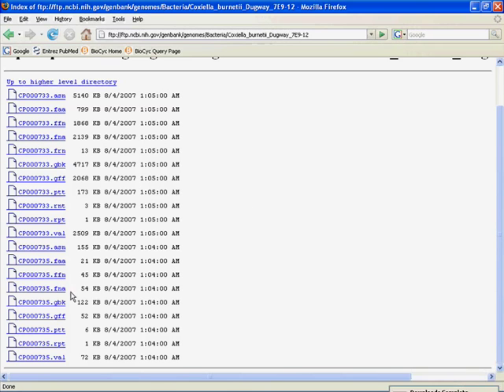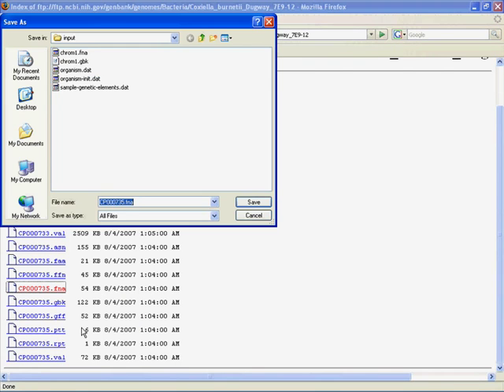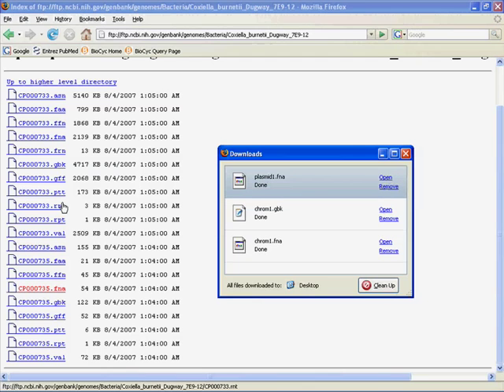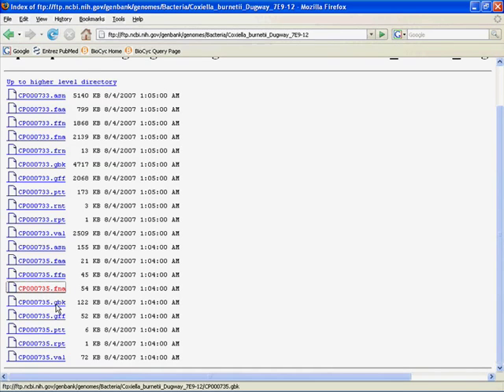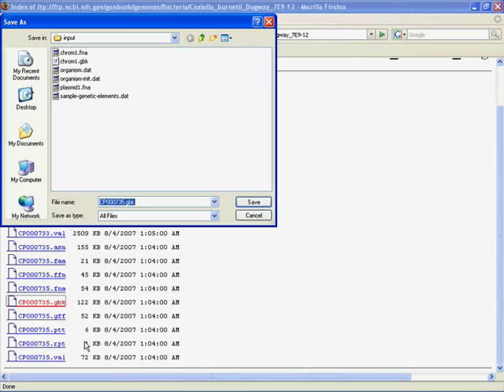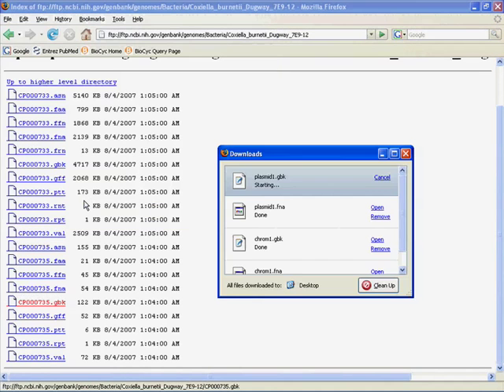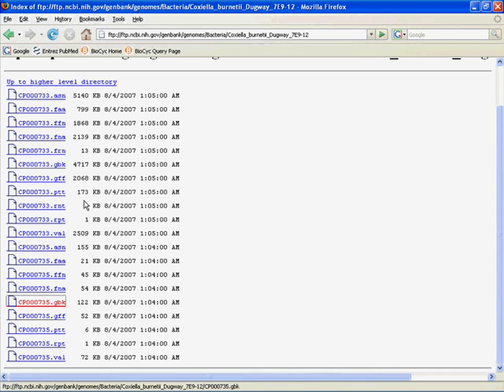Now we have the plasmid. And we'll call this plasmid1.fna. That was fast because it's tiny. And let's get the GenBank file here. Plasmid1.gbk. Sounds good. Done. Also very fast.